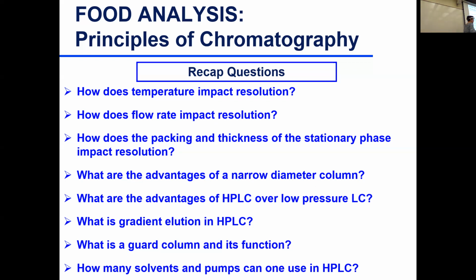So in general, with higher flow rate, you get equilibrium faster and movement faster, and the rate of diffusion, which is longitudinal diffusion, will be lower. But too fast of a flow rate, again, we won't have good separation and peaks will come out together. So we really need to find the optimal flow rate for your particular analysis. And it's not the same for each compound because different compounds equilibrate differently, different types of columns have different stationary phase, so equilibration varies based on stationary phase, mobile phase, and constituents of interest.